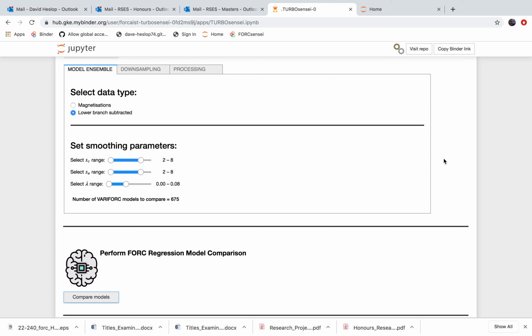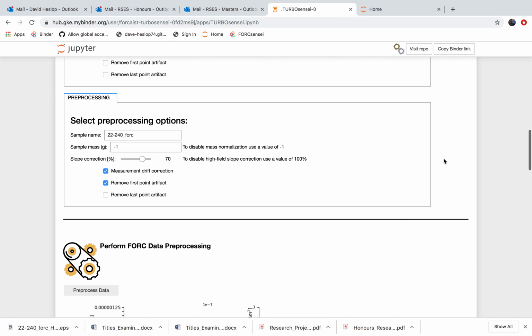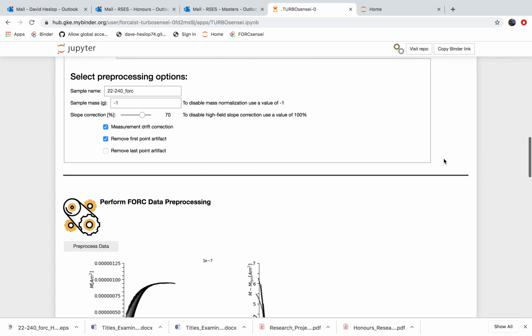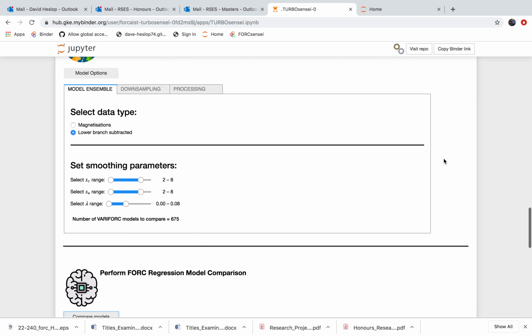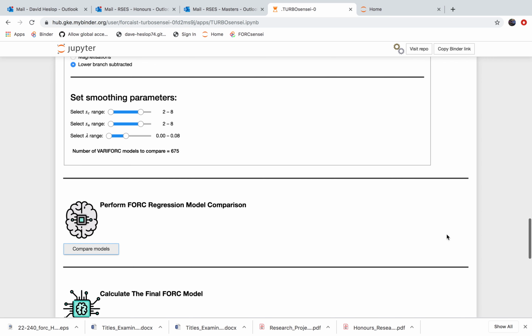It's assumed that things are going to happen in a very specific order. And I guess the recommendation there for people is to decide in advance what you're going to do, to process different samples, start different instances on the cloud and so on, rather than simply trying to use one notebook to process everything in one go. Okay, so that's not quite as nice as it could be in terms of usability, but it's difficult, particularly in the parallel processing, to set things up so that you can go back and modify things and everything's updated automatically.